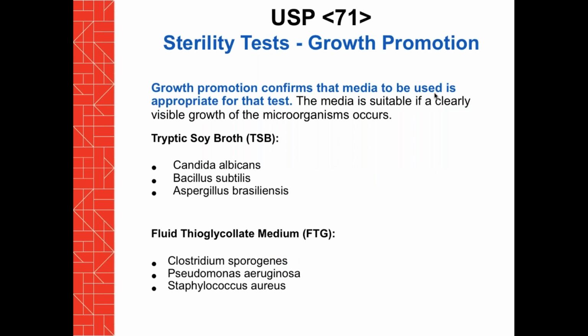Growth promotion confirms the media to be used for the different tests: Candida, Bacillus, and Aspergillus are used with the TSB, and then the fluid thioglycolate, or FTG, is utilized as the media suitable for Clostridium, Pseudomonas, and Staphylococcus aureus.